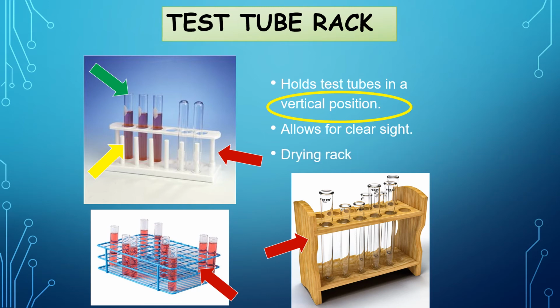And then it is used also for drying rack. So this one we're going to use for a drying rack. That's this one also. You dry first the test tube before you're going to keep it.